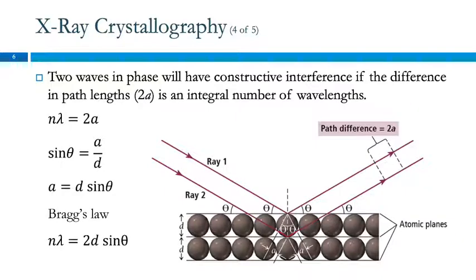And so all of that to say, this comes down to what's called Bragg's law, where lambda is the wavelength of the X-rays. D is the distance between the two layers of atoms. Theta is the angle of incidence. And N is just an integer, because this could happen if you go 2 layers apart or 3 layers apart, whatever.